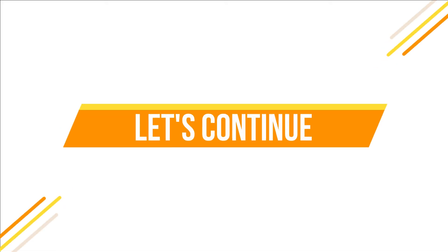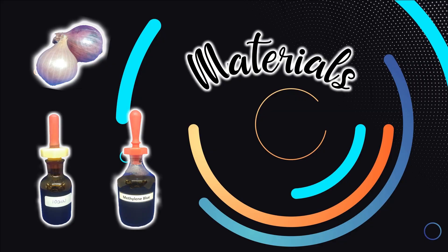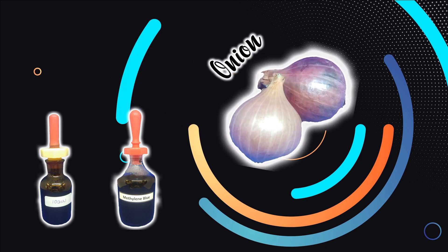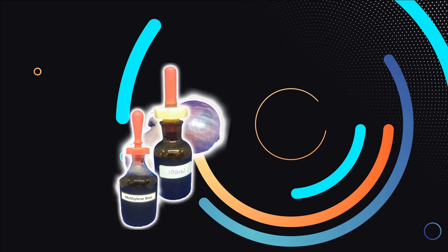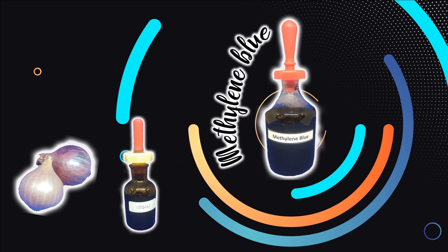So let's continue with our experiment. First of all, let's start with the materials and apparatus needed. There are 3 materials needed in total. They are onion, iodine, and methylene blue.